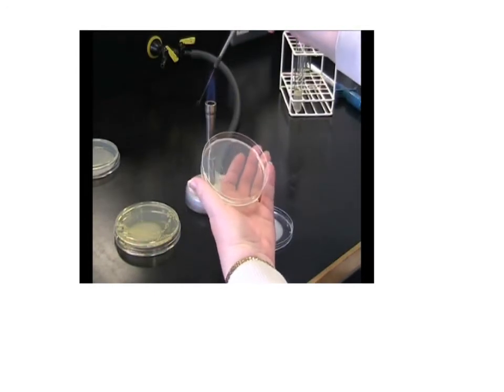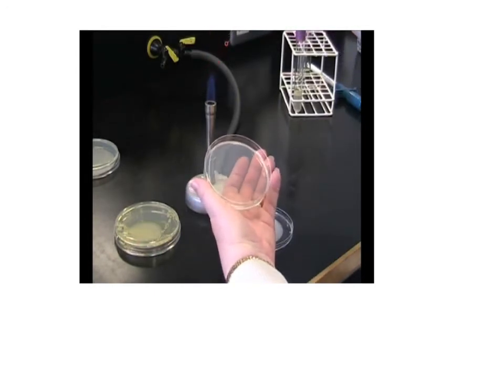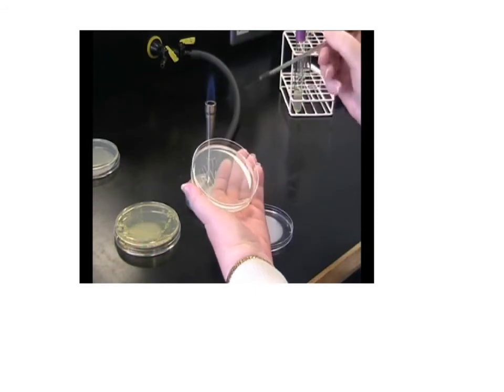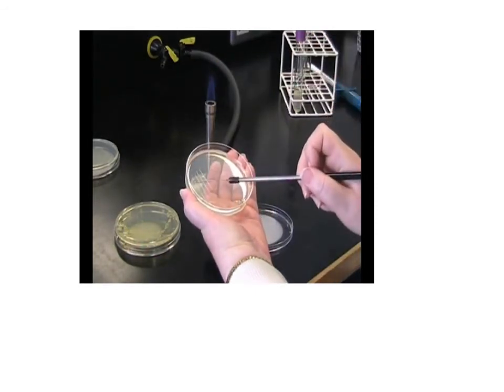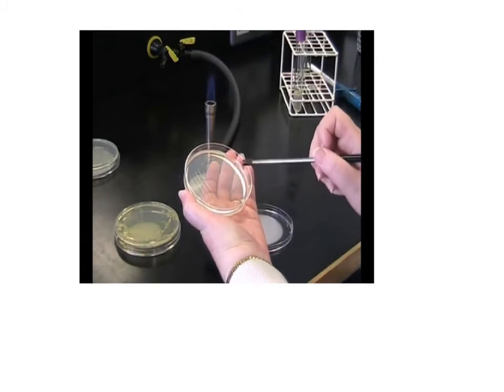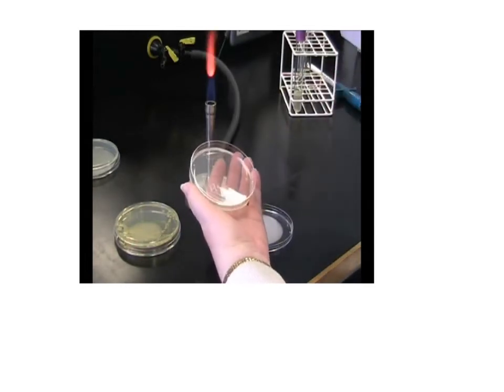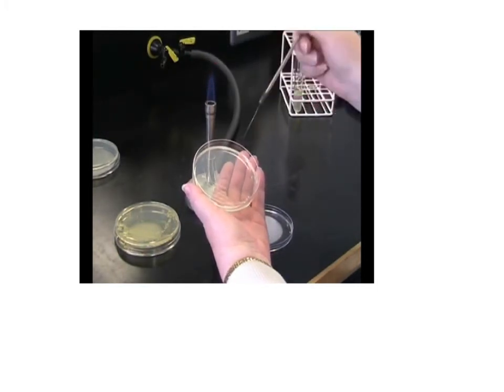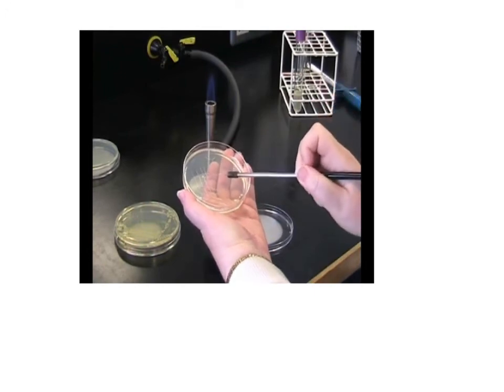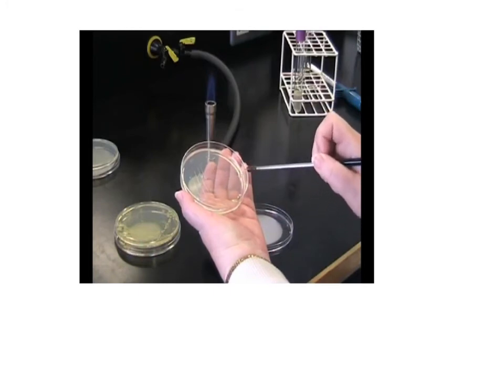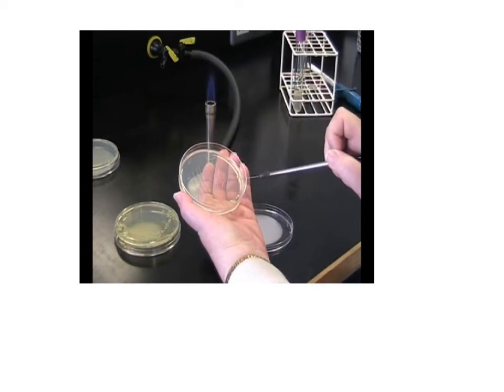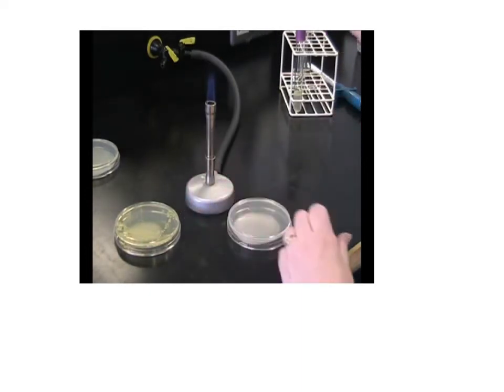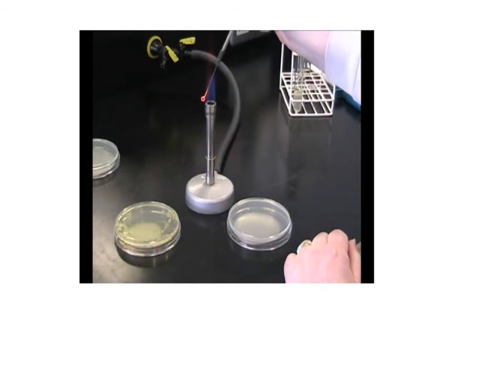It's important now to flame your loop again. Cool your loop and repeat this process, taking one streak from each of the four across your agar plate. At each point where you rotate the plate, you need to cool, flame and cool your loop. By doing this you are diluting the number of bacteria on the loop. Finish with a streak down the centre of the plate. Replace the lid and always finish by flaming your loop to avoid contamination.